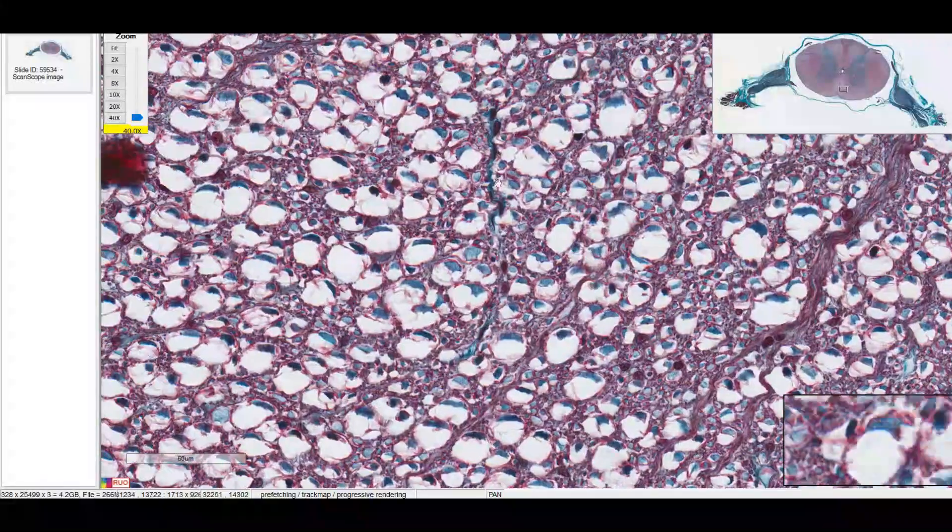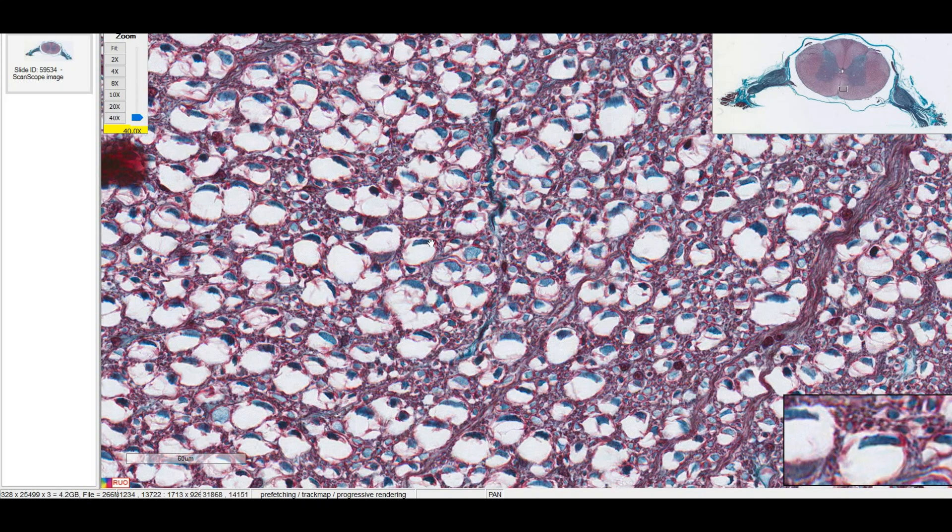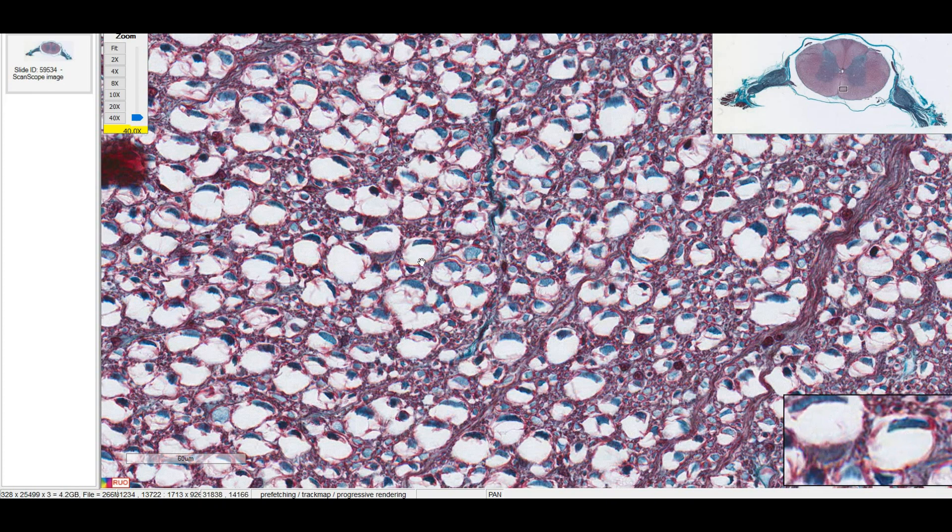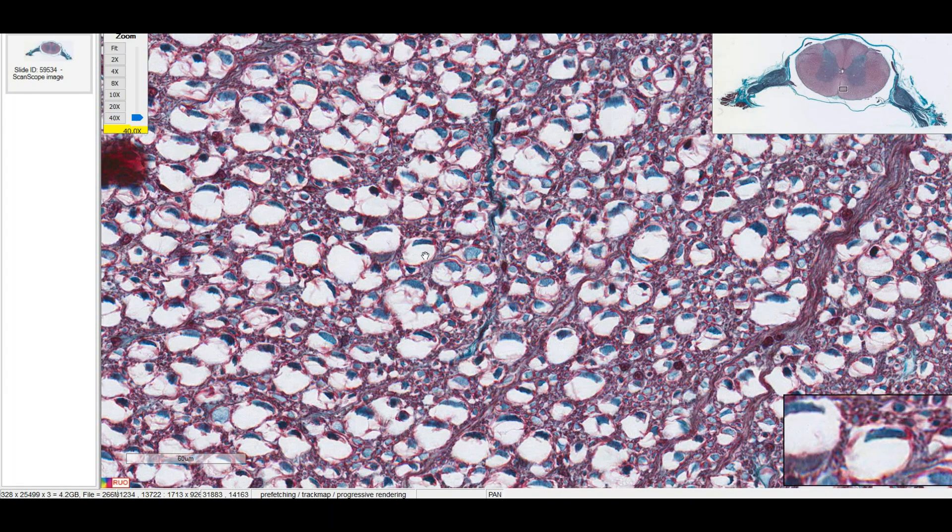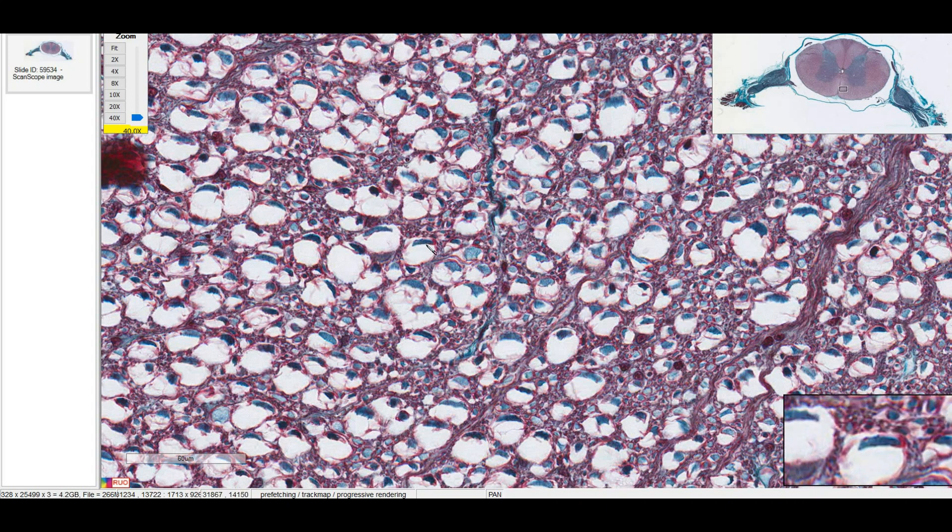Now let's take a closer look at the white matter. If we zoom in here, we see this bubbly appearance. There's lots of, looks like little holes where you have these light blue shapes. These things, the light blue, are the actual axons. And in the space, this is where the myelin used to be before it got washed out when the slide was being prepared. So these guys are all axons.